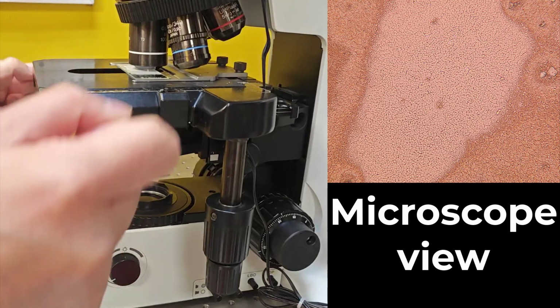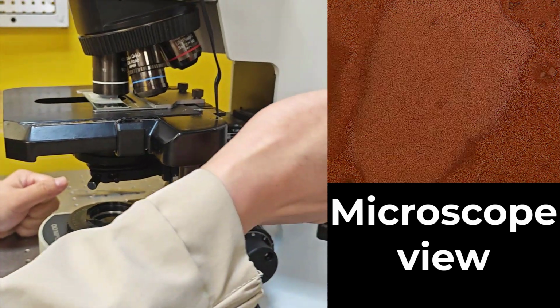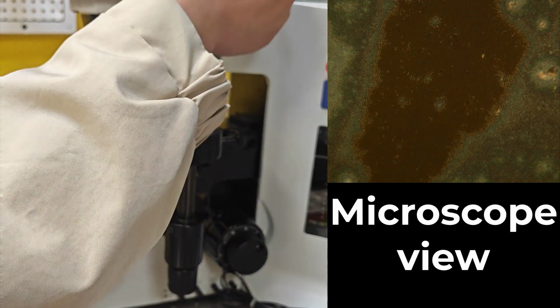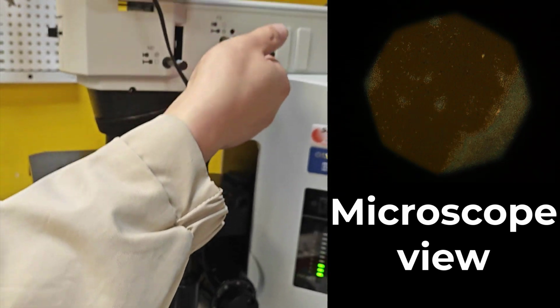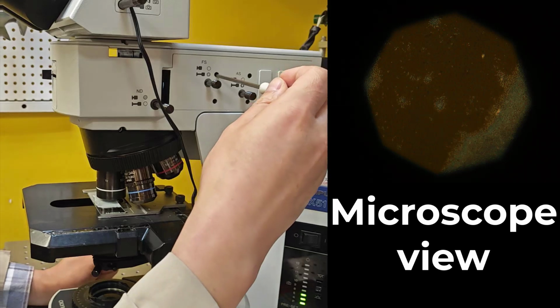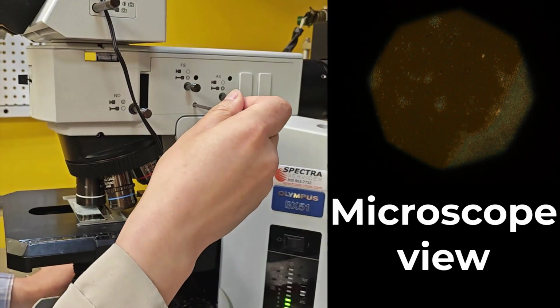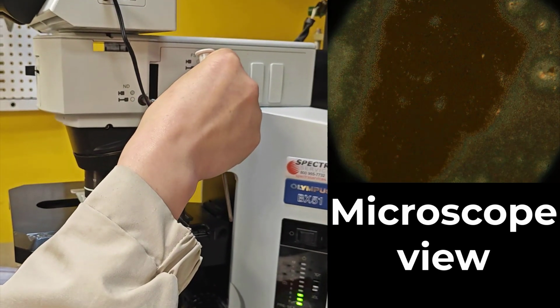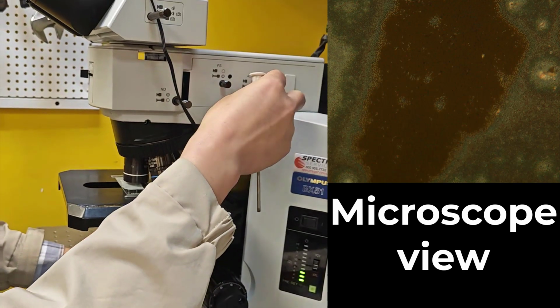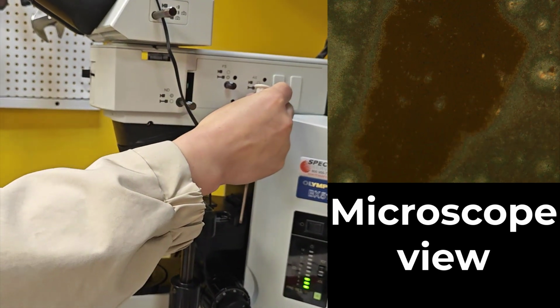Now we can switch to the reflection path. On the reflection path, we have two light stops similar to transmission, FS or field stop, and AS or aperture stop. Both of them need to be centered. For the field stop, you can directly observe it by reducing the aperture and seeing it on the camera and through the eyepiece. While the aperture stop needs to be centered by removing the eyepiece.